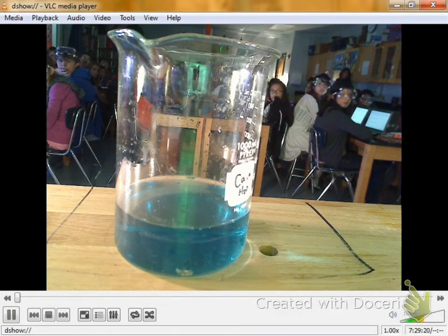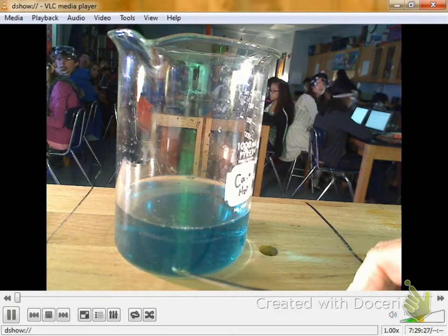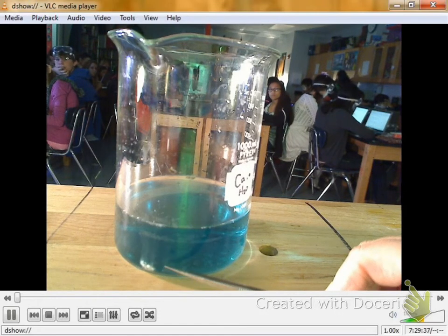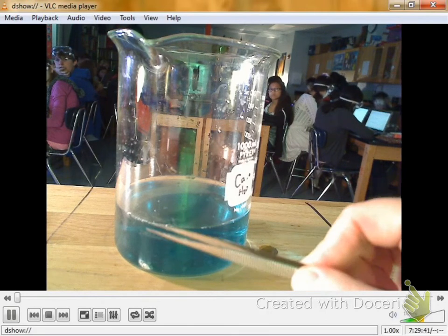And yeah, it's making bubbles. You can kind of see it. It's making some bubbles. It's starting. You see how it's kind of moving and wiggling down here? That's the hydrogen gas bubbles forming on it. And of course, where does the hydrogen gas want to go? Up. Yeah, it wants to come on up. You see lots of bubbles forming now.